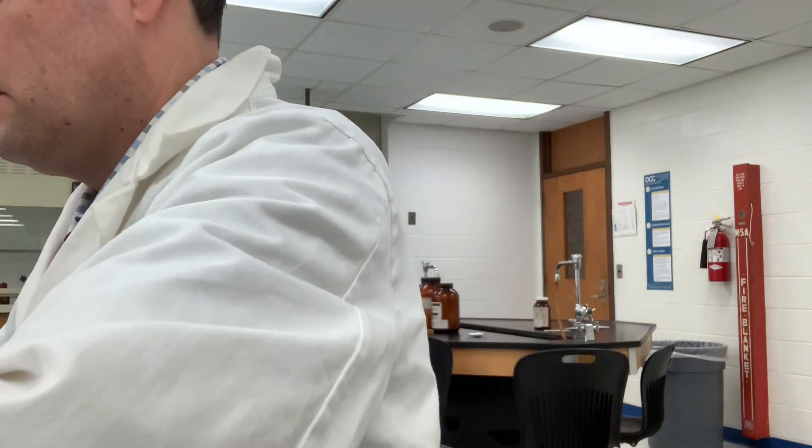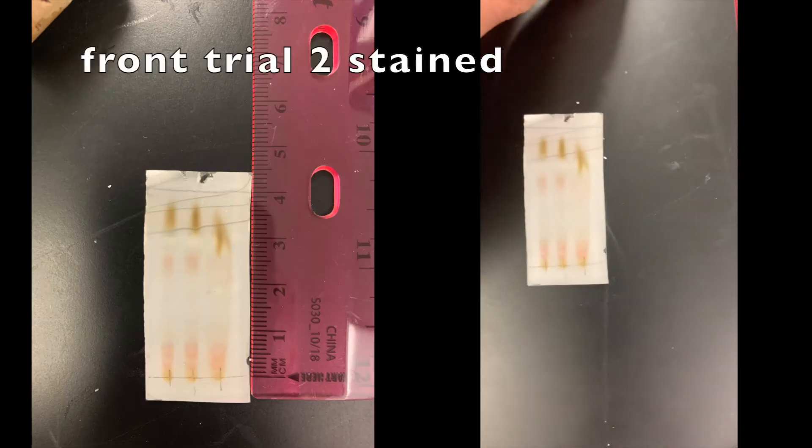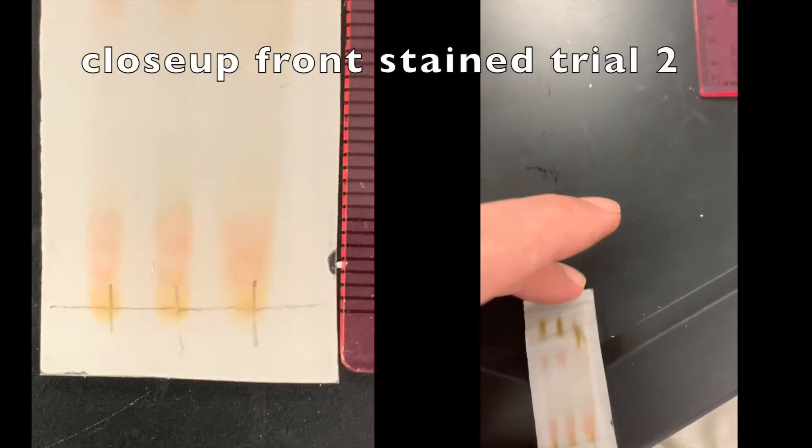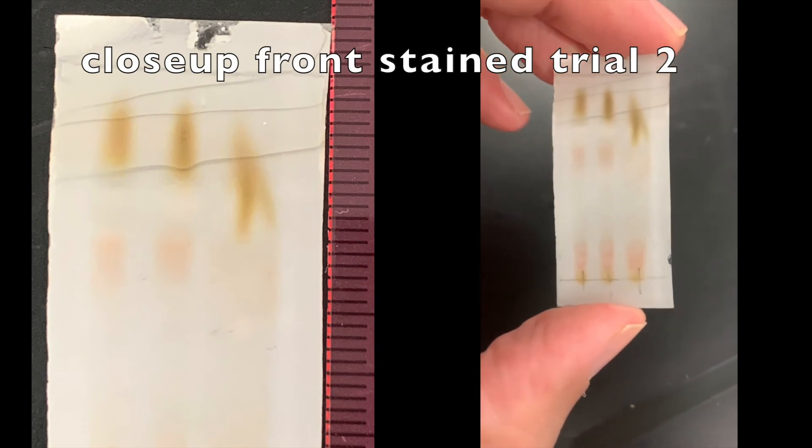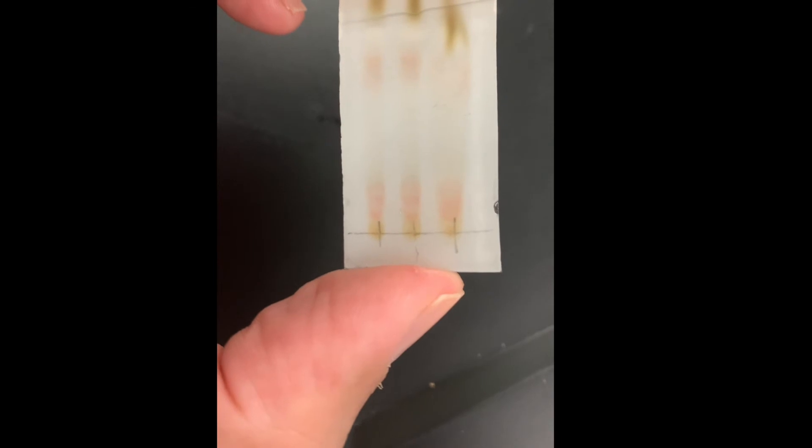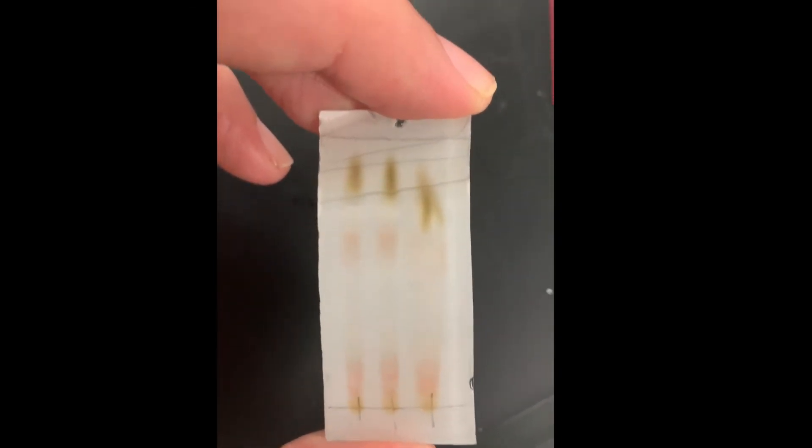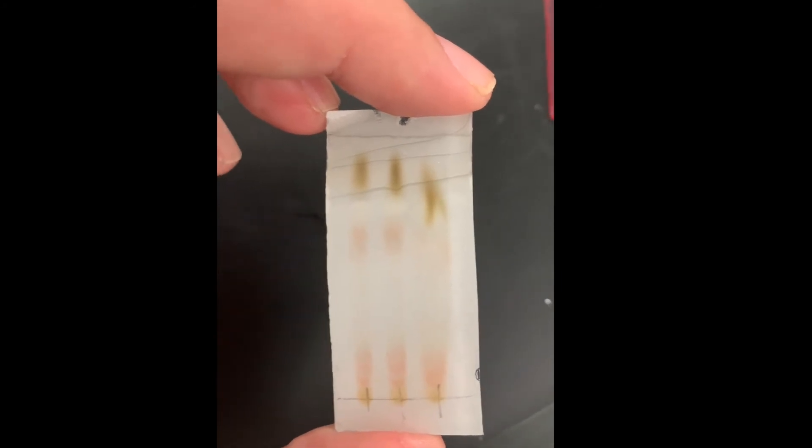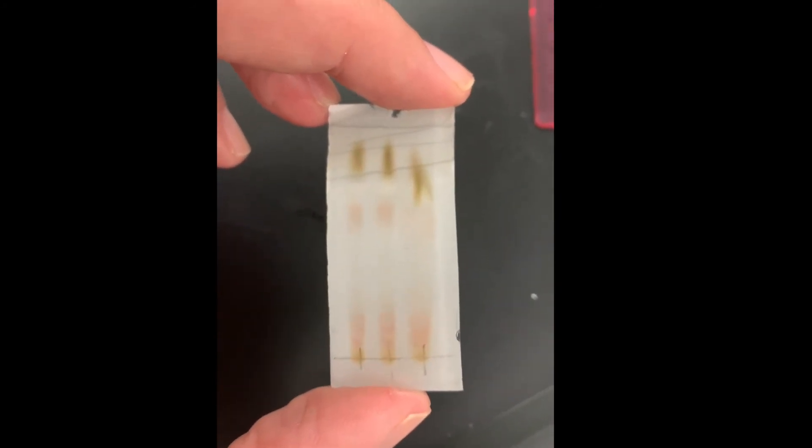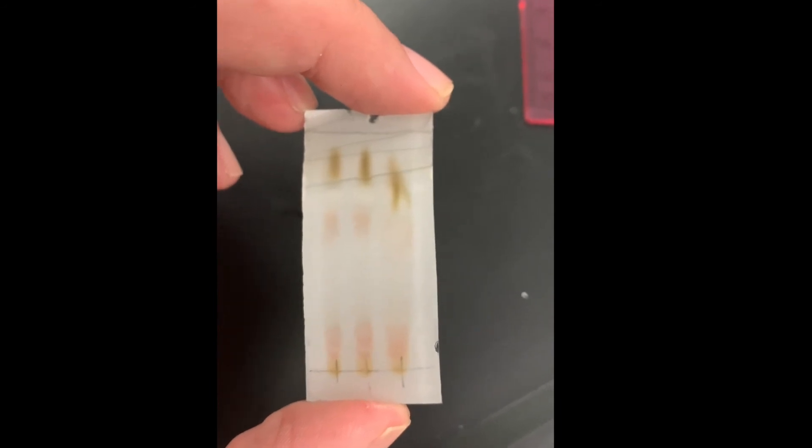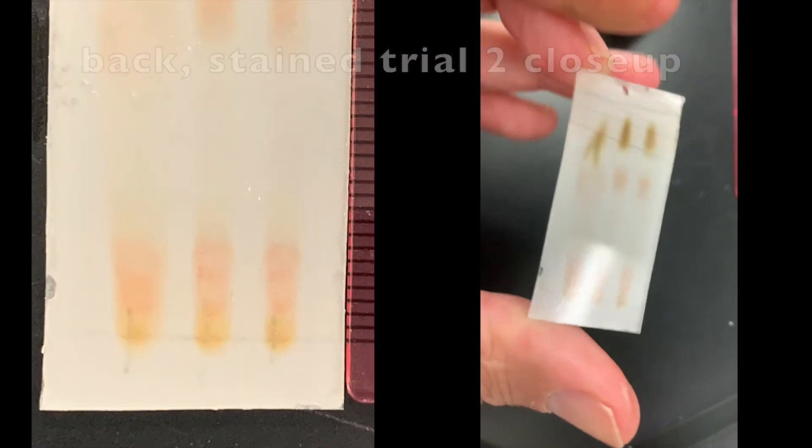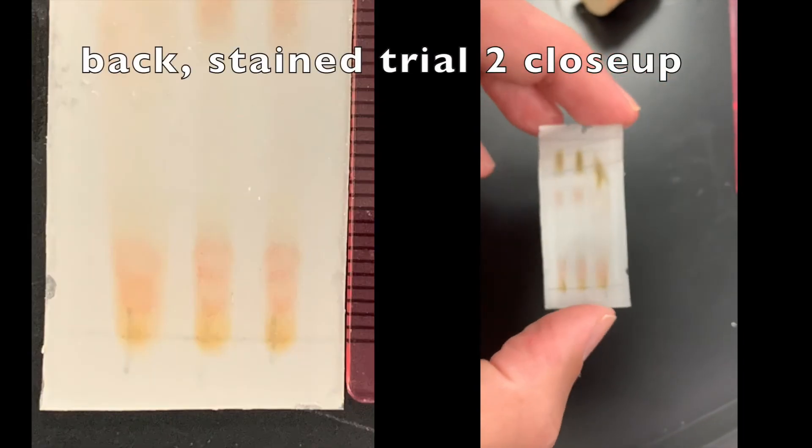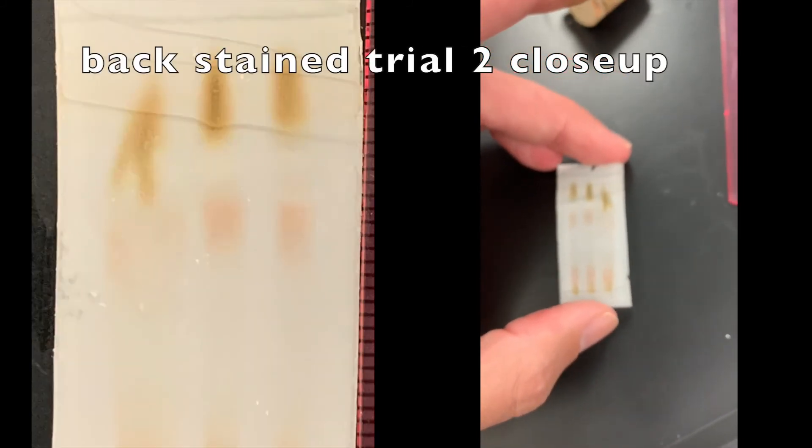And the results, I suspect, are going to be much, much better this time around. All right, so this is the stained TLC plate with the cerium salt. So you can see how the spots kind of overlap a little bit there. There's a little pinkish spot in the middle and the chlorophyll really jammed up. Now this third column here, I didn't let the ethanol fully evaporate, so that's why you've got that coma or comet effect there on the right, and we don't want that. If I flip it over, the third lane will be on lane one. So ignore lane one on the back, ignore lane three on the front. So let me take a picture now, and I'll post this.